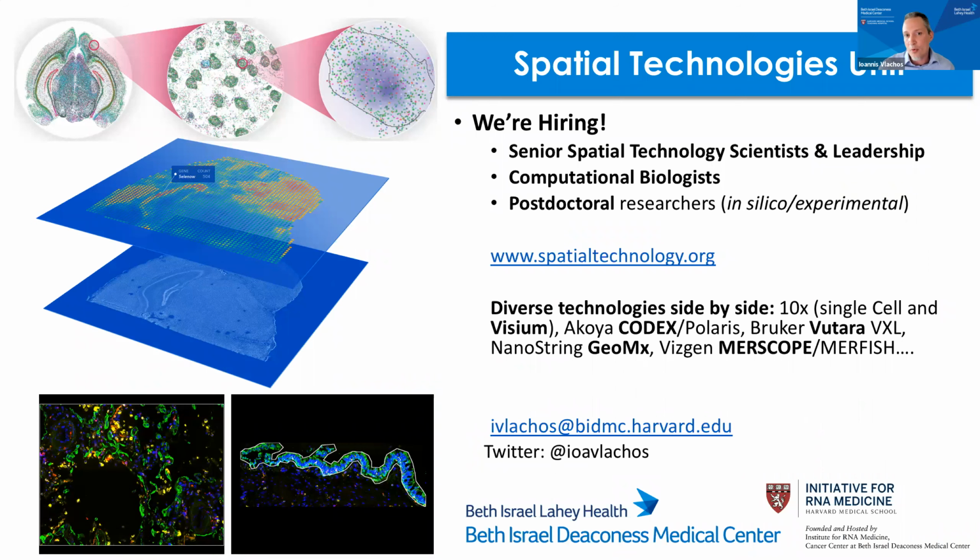For spatial, the sequencing-based assays are quite powerful because you can get more than you expect based on sequence. And the assays that have very high resolution, like the single molecule FISH, where you can go subcellular, you can get some very nice questions answered for translation. If your RNA is in the endoplasmic reticulum, you can get information about your long non-coding RNAs if they're in the nucleus. You can get a lot of things that the assay was not meant to address, but it's free information for you there.